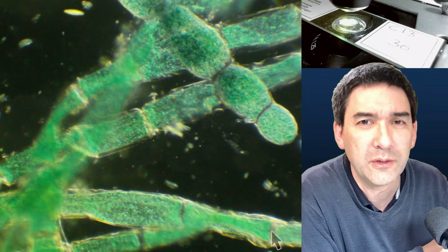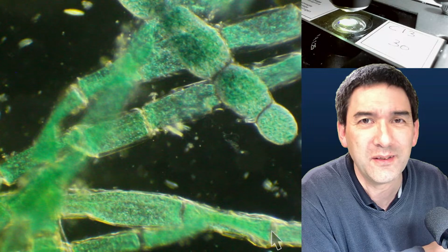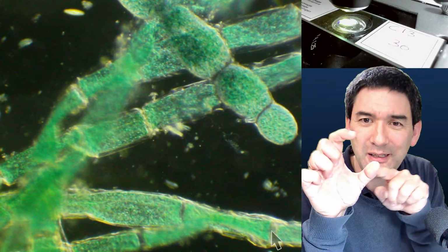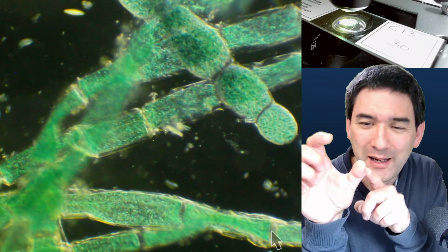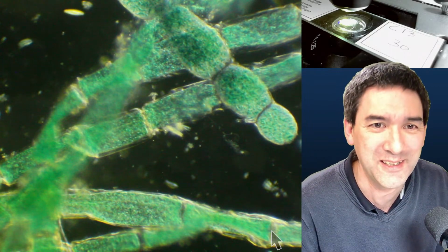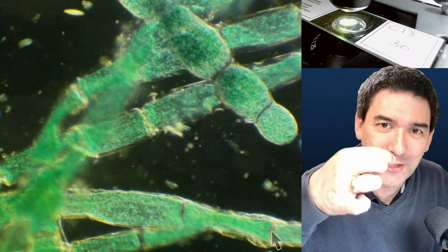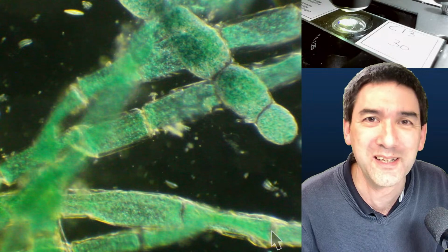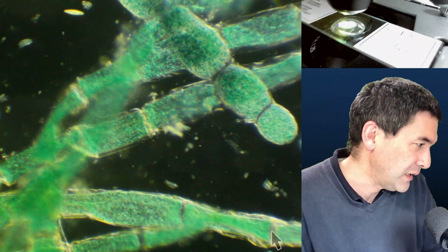Why am I able to get dark field like this? That's a little bit of a trick. Because I now placed the filter holder, which has a plastic ring on the outside, right? If I just move the edge of the filter holder into the light path, then it acts a little bit like a dark field filter. It's a pure coincidence. So simply the plastic ring on the outside, when it's kind of in the center, gives you by coincidence a dark field effect. Which magnification? I'm using now 10 times.